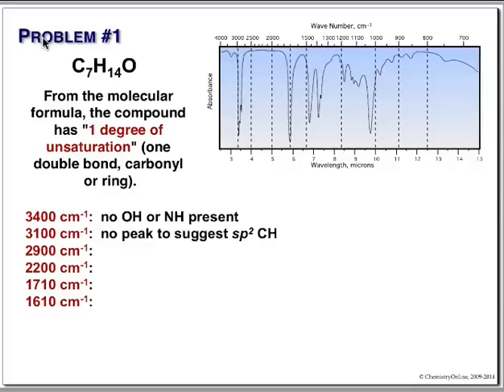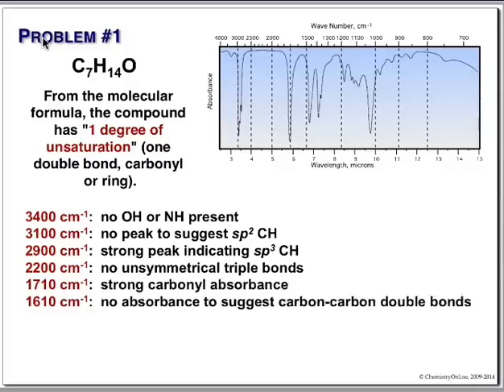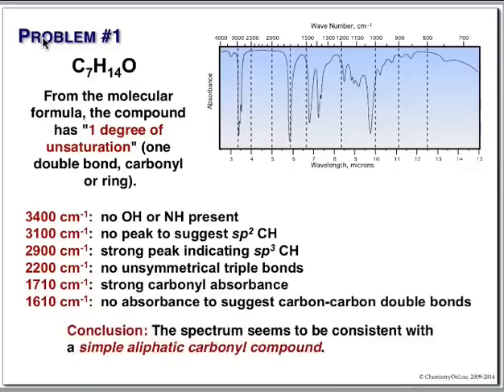We do have an oxygen. Again, we could have put in that there is no evidence of an aldehyde. 2900, nice peaks. Nice saturated CH. 2200, triple bonds. Nothing there. 1700, great, big, happy carbonyl. So this is a ketone, isn't it? Right here. And nothing there, is there? No carbon-carbon double bond. So what have we got? Just like the other example, simple aliphatic ketone. So quickly, write down the structure.